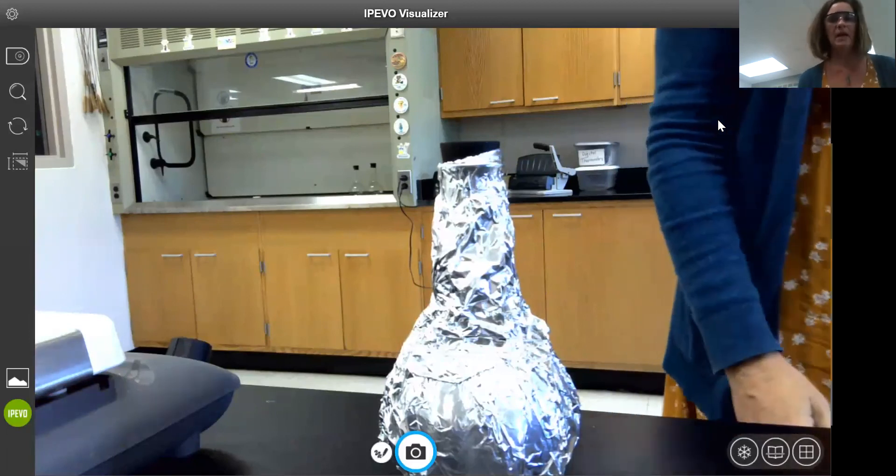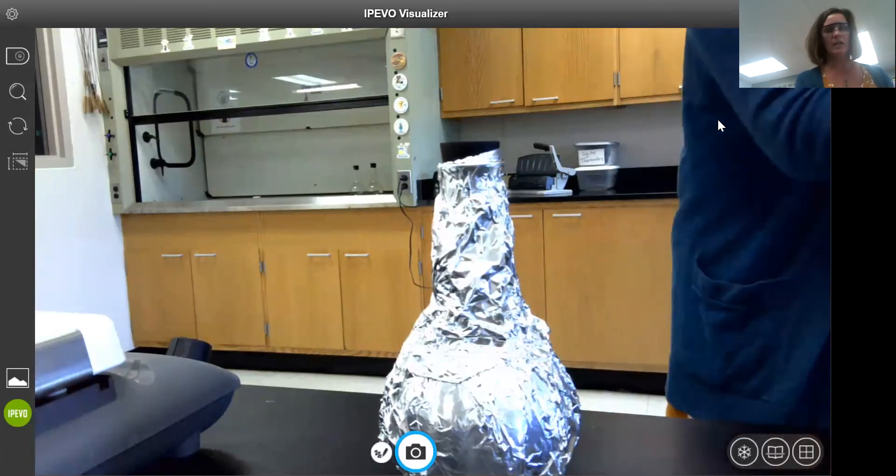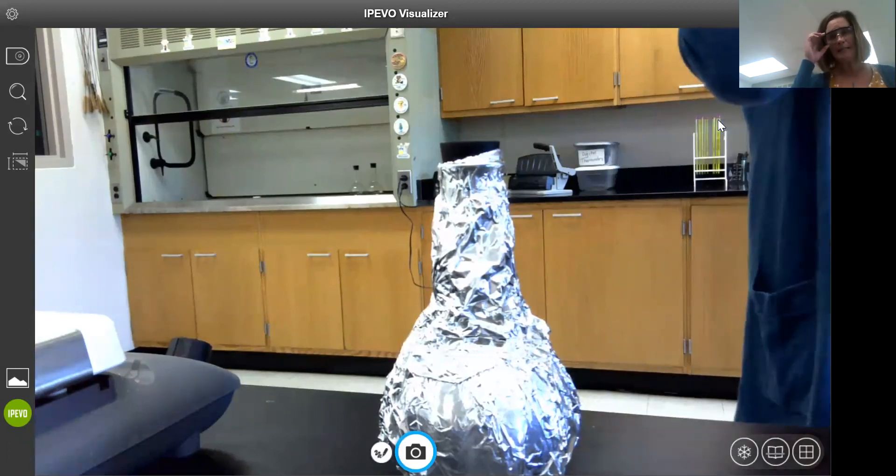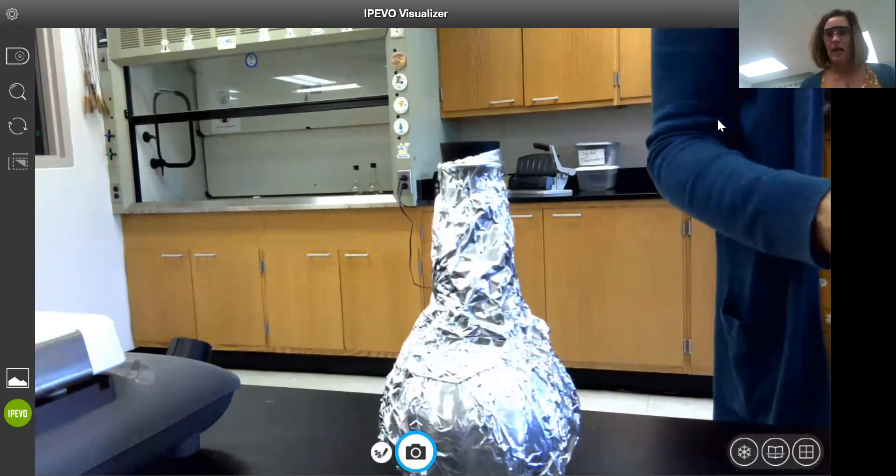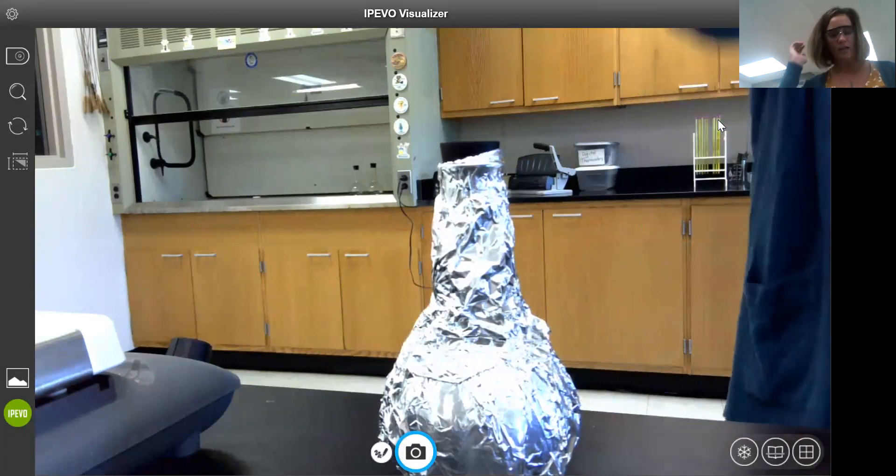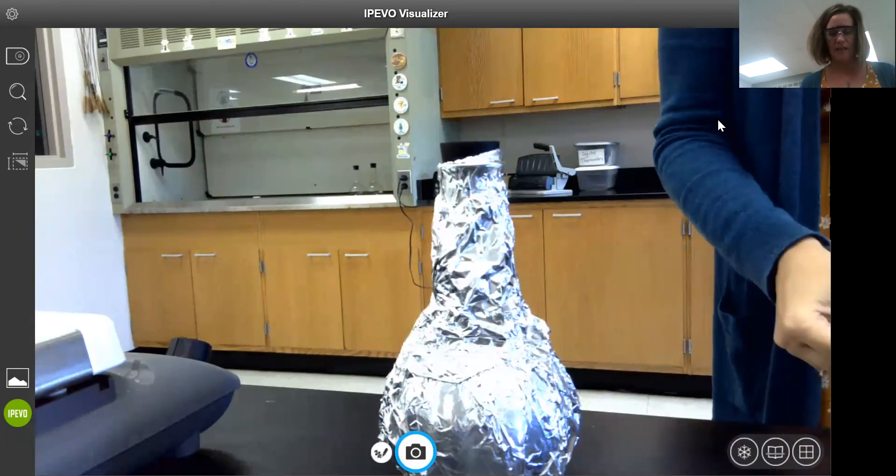So now we have prepared the KMnO4 solution that we're going to be using in our redox titrations. Our next step will be to standardize this solution using a primary standard called sodium oxalate.